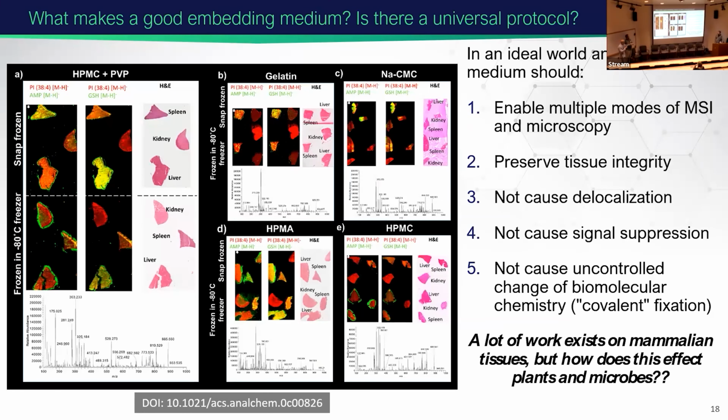Okay, so I also want to tell you that we usually analyze samples from EMSL users. If you ever want to send us samples, we need to talk deeply. If you already have experience in sectioning, we also need to provide you conductive slides, usually with a requirement, for example, multi-imaging. So if you're experienced and know how to do it, we can provide you slides. You send us those slides back. They need to be vacuum sealed as well and put back to us, and we can talk.